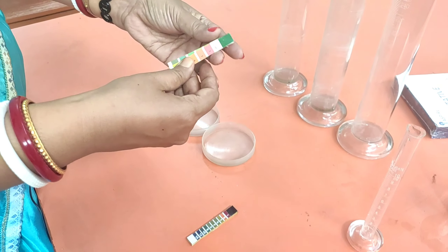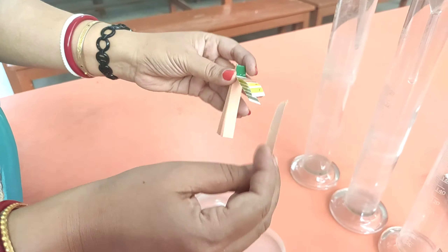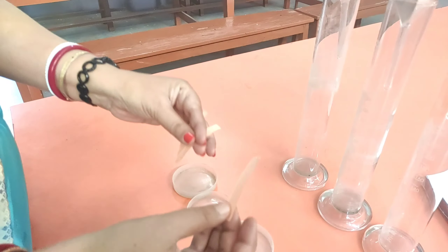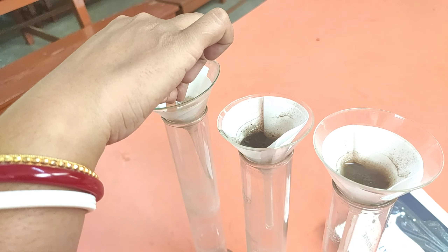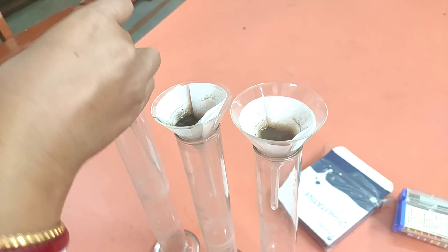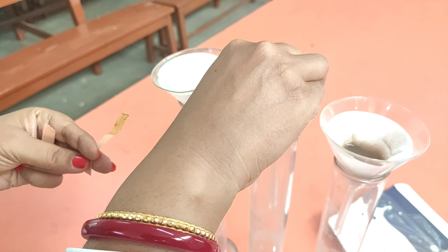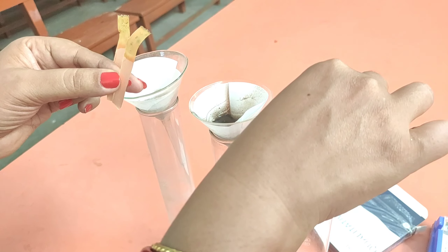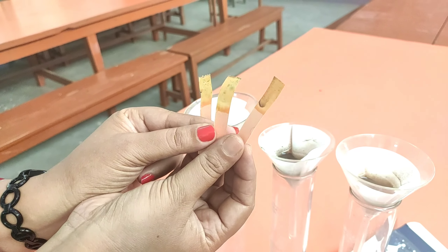Next we have to check the pH of these three types of soil with the help of pH paper. We will collect three pH papers for three different samples. In this wet soil you just dip the pH paper and let it dry for some time. This is the pH paper in the first sample, this is the pH paper dipped in the second sample, and this one is dipped in the third sample.